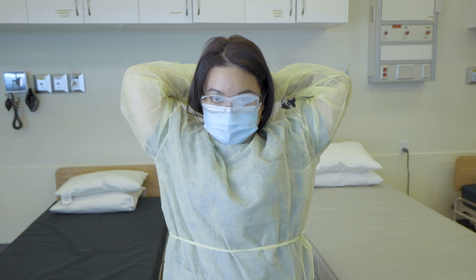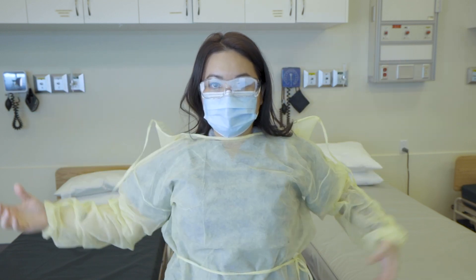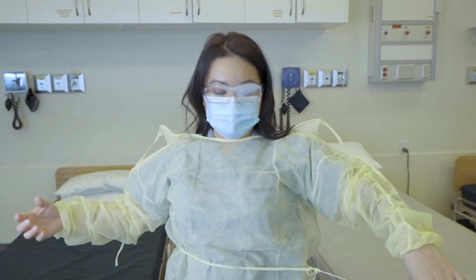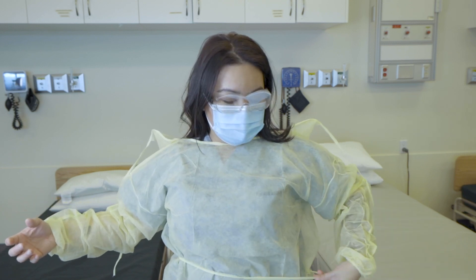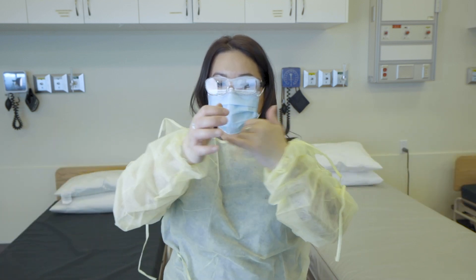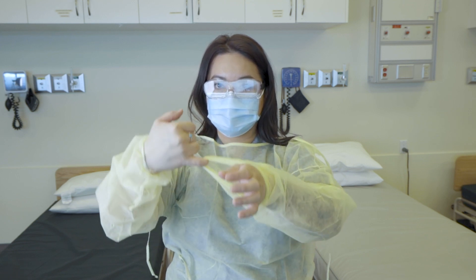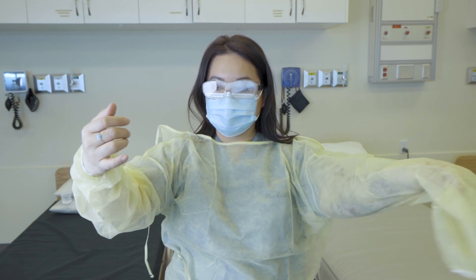Without touching our face and avoiding our hair, we want to unravel the knot from behind our neck and also at the waistline. We would use one of our fingers to scoop off or hook onto the inner portion of the cuff of the gown.